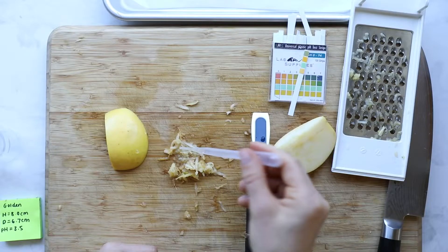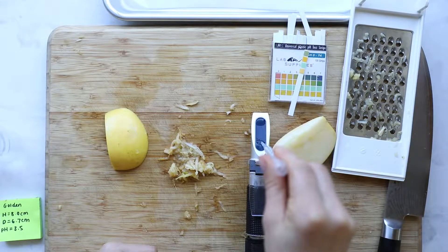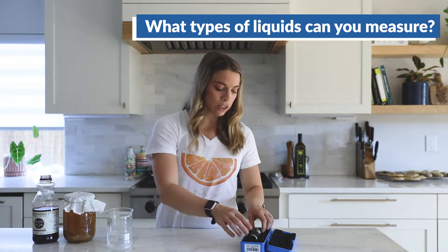A refractometer is used to measure sugar content in any type of liquid. We've used it to measure the sugar content in apples, kombucha, and other juices, and we're going to show you how to do that right now. It's super simple.